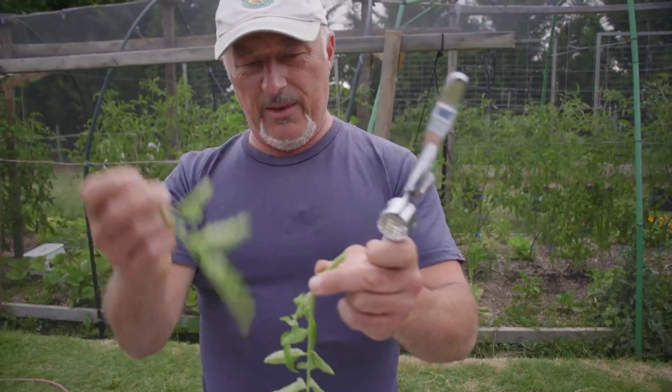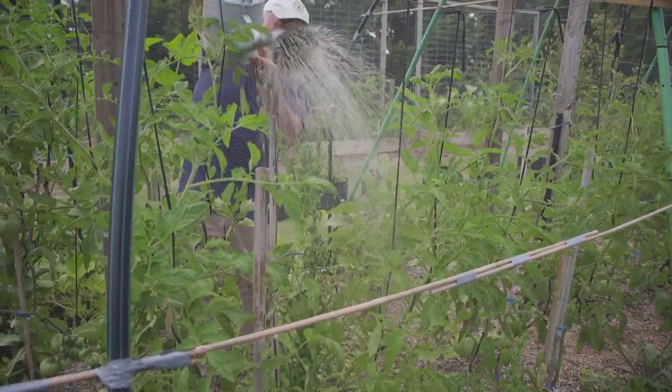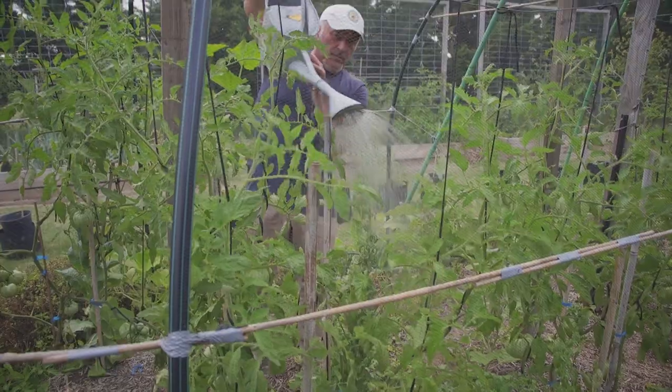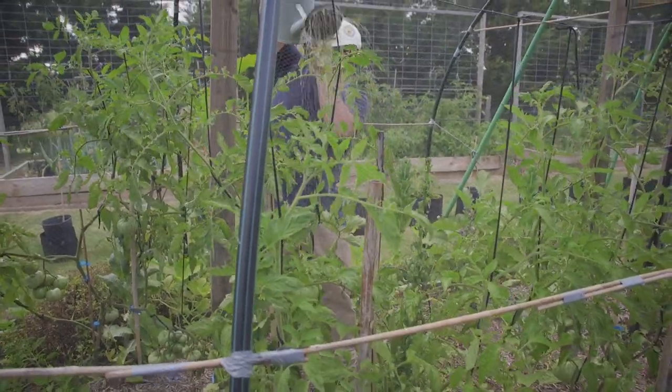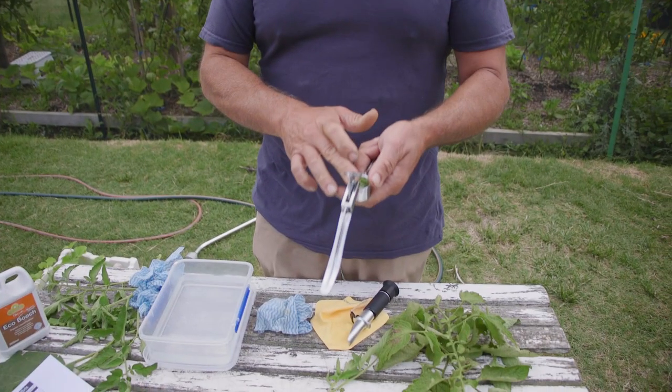I'm going to take this stem here, and also I can mention that for the same plant I applied some Eco Booch biostimulant and foliar-fed them, so I can test those leaves as well. These were picked before I applied the Eco Booch on them and we're going to harvest the leaf afterwards and test it and see if there's any difference in the Brix measurement.